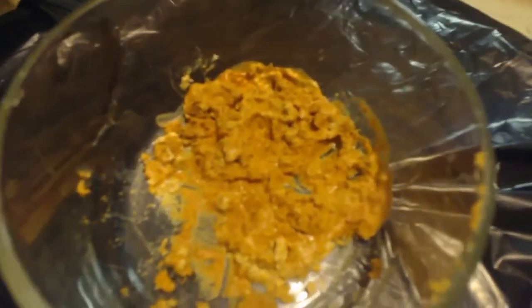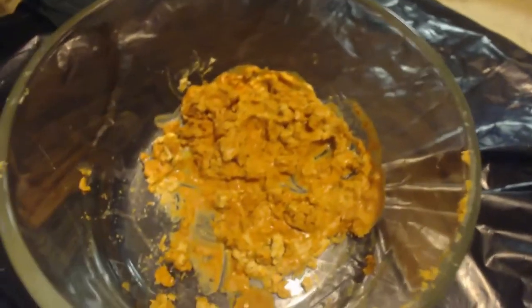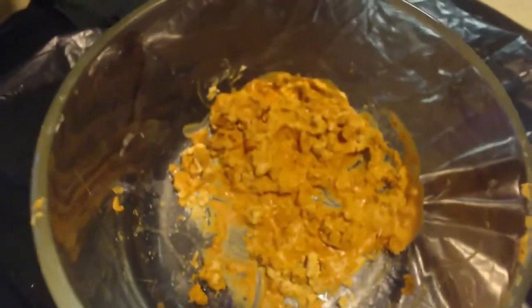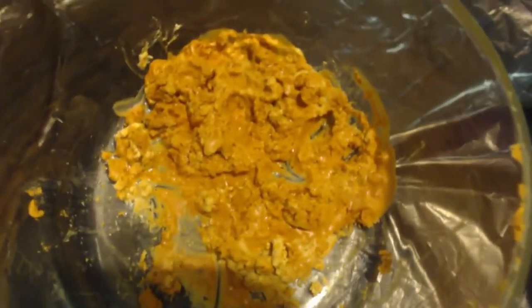That's definitely pure enough to do a decarboxylation. But since there's only 25 grams, you could, for every 10 grams, put a liter of water. So that'd be 2.5 liters. Boil it up and throw this in it so that it dissolves, and then you'll get those really nice, smooth, silky, needle-like crystals like you get from benzoic acid. Because this is basically benzoic acid. It just has a methyl group attached to the benzene ring. So it's basically the same stuff. I'm not going to do that because all I'm doing is a decarboxylation. So this will be good enough.